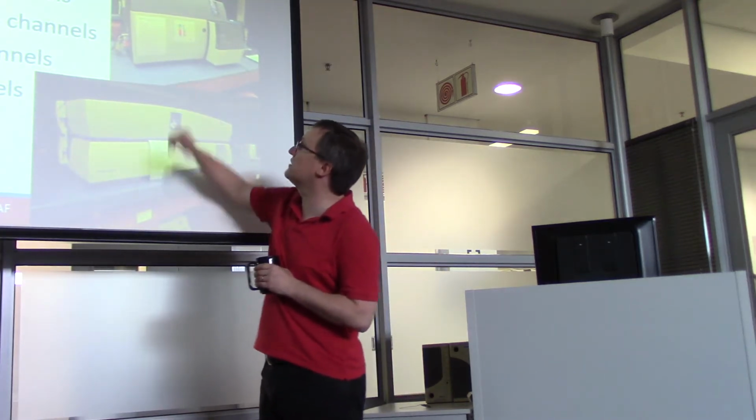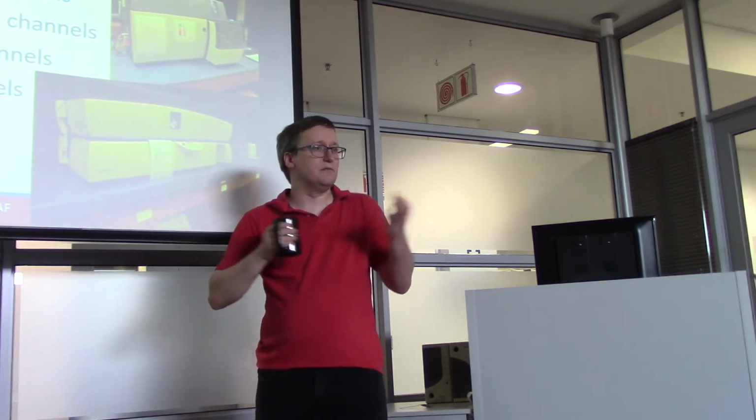We also have things like the Canto 2, which can measure 8 channels. So these instruments are all available, and if your experiment really needs one, if you don't have one here, you can use ours. We'll just have to figure out the price for doing those operations, but I'm sure that's not going to be a huge barrier.